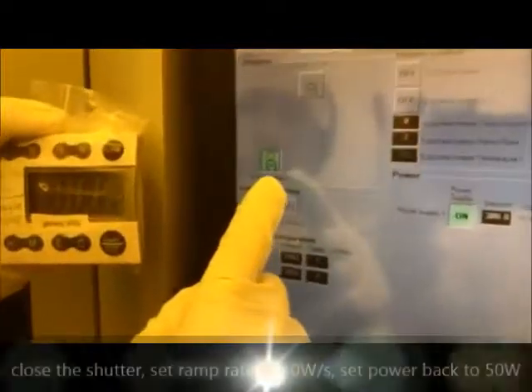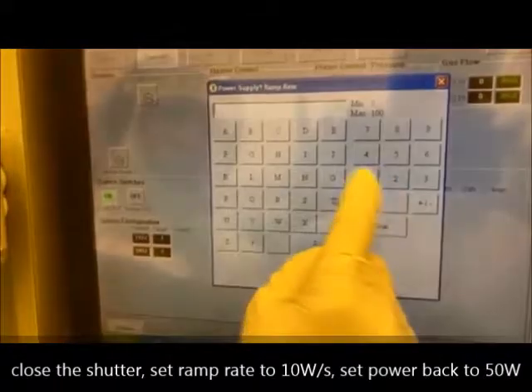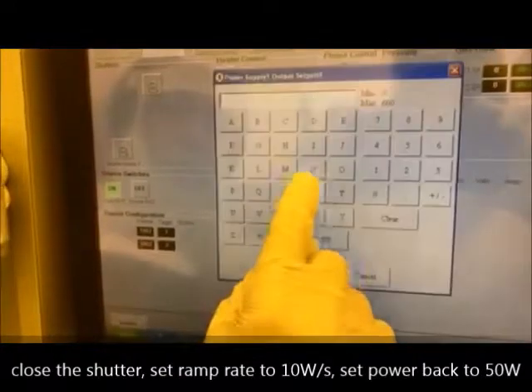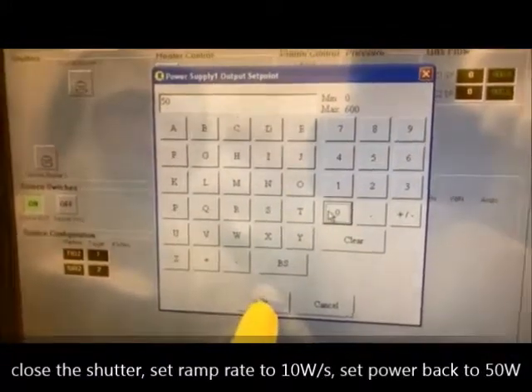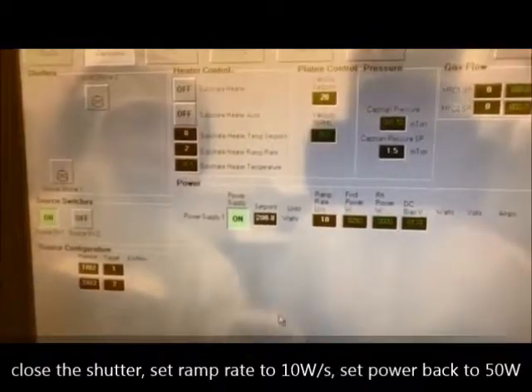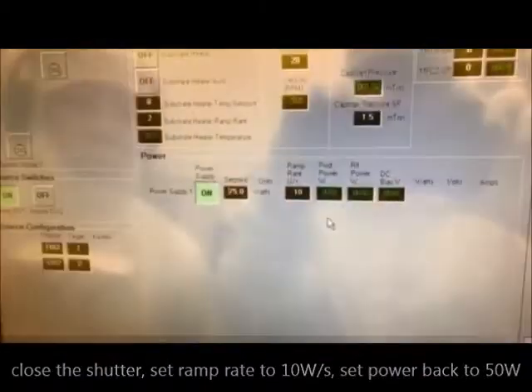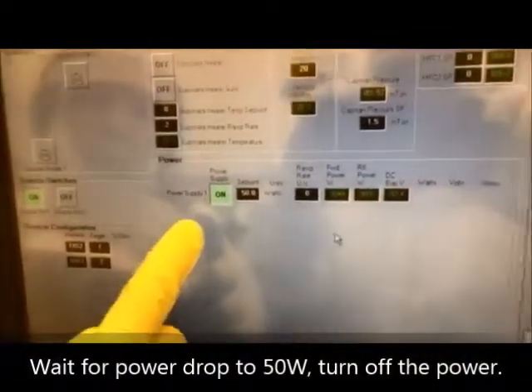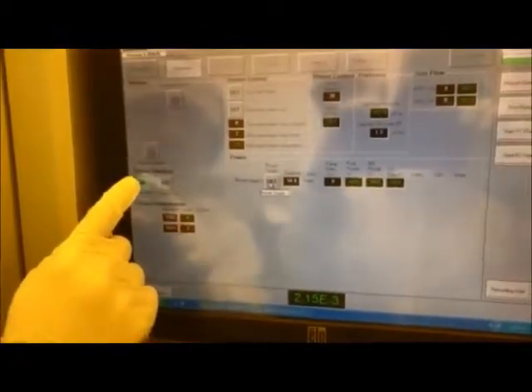So at 0, I'm going to close the shutter. So 3, 2, 1, 0. So I close the shutter. I select the ramp rate back to 10. And then I set the power to 50. So you should see the power drop. Once the power drops to 50, I'm going to shut this off. Yeah, so now it's gone to 50. I'm going to shut off the RF power. So I turn this off, and I also turn this off.